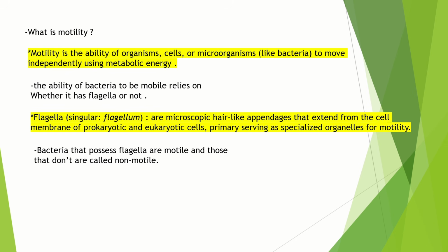Motility is the ability of organisms, cells, or microorganisms to move independently using metabolic energy. The ability of bacteria to be mobile relies on whether it has flagella or not. Flagella are microscopic hair-like appendages that extend from the cell membrane of prokaryotic and eukaryotic cells, primarily serving as specialized organelles for motility. Bacteria that possess flagella are motile, while those that do not are called non-motile.